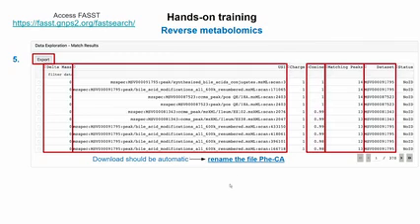So it will be a CSV file, and then you need to rename that to phenylalanine conjugated CA, like PHECA. Is there something more that we need to do? Yeah. So how many of you are able to get here? Oh, quite many. Good. Anyone lost any of the steps and needs help? Nobody. Great.